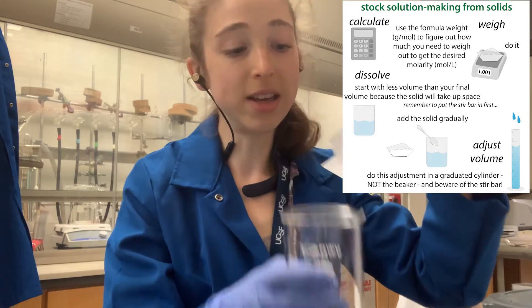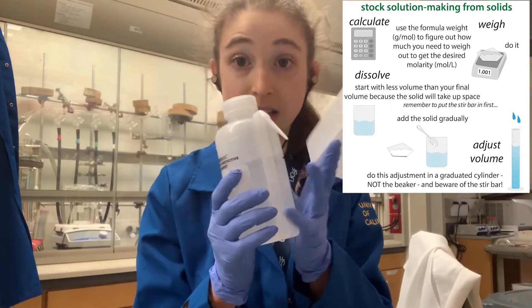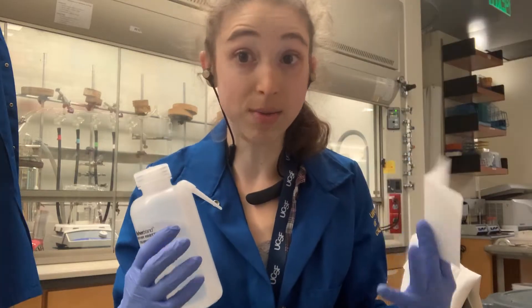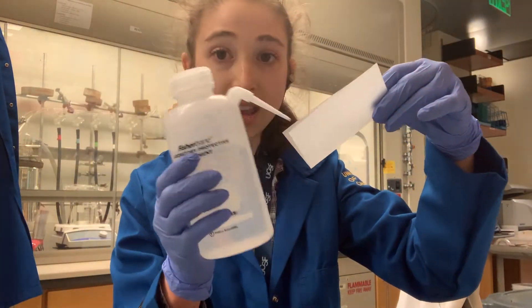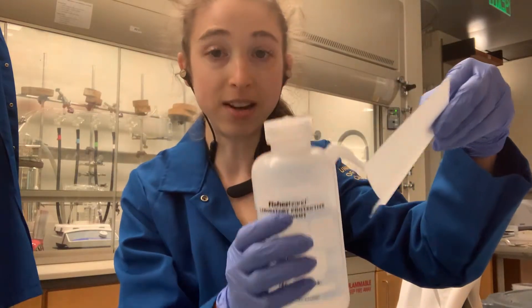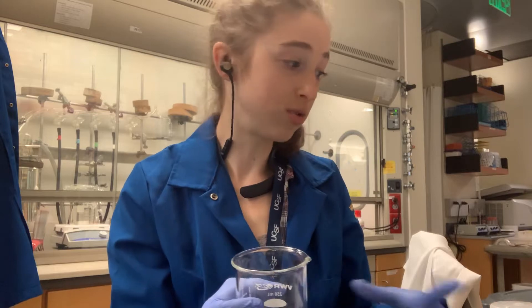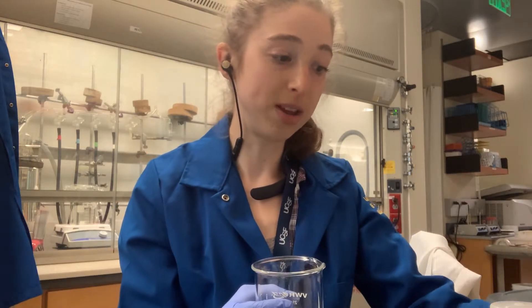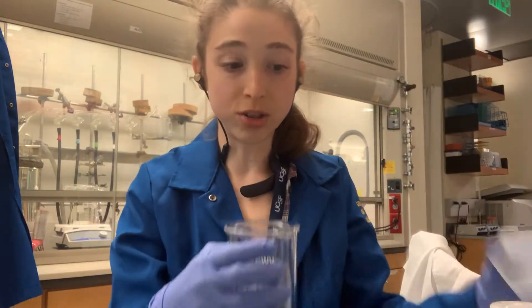What I like to do is take a water squirt bottle — make sure it's purified water, the same water that you're making your solution in — and then you can use this to squirt in and kind of get the excess solid off into the solution. You can do it that way, or if you're using a Weibo, use the water to squirt it off.